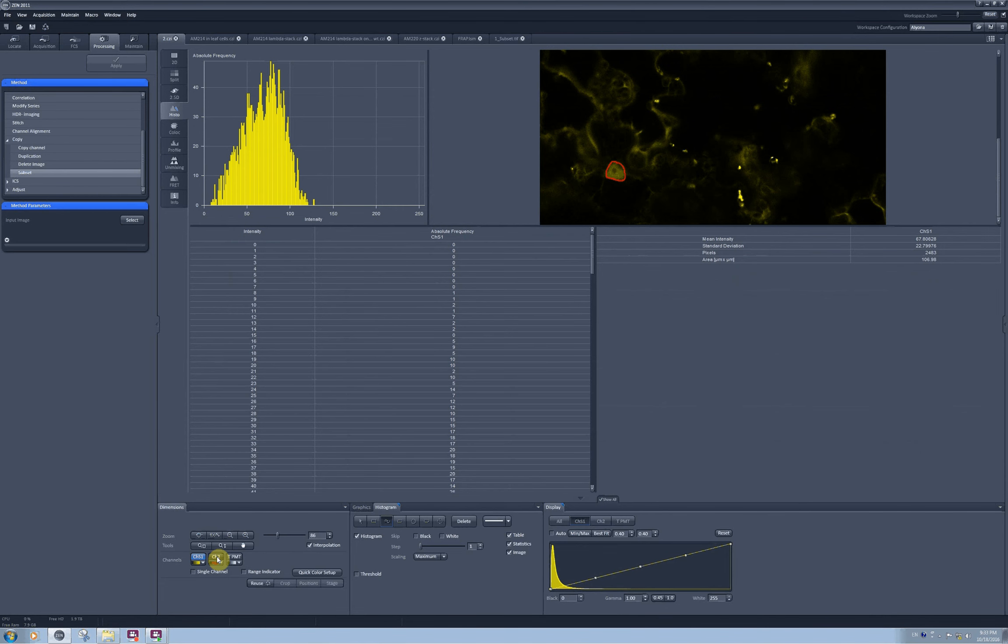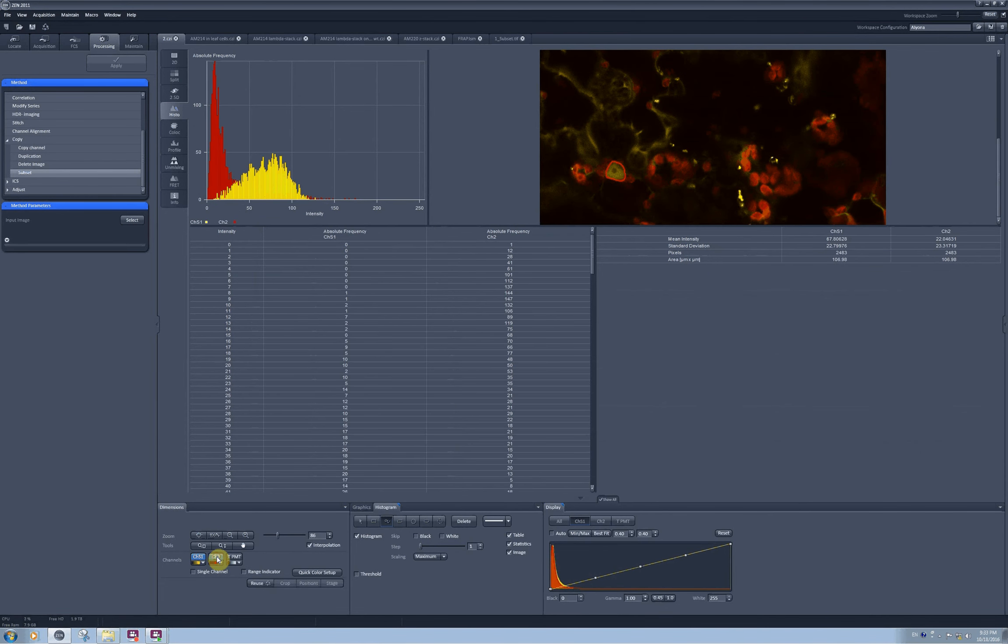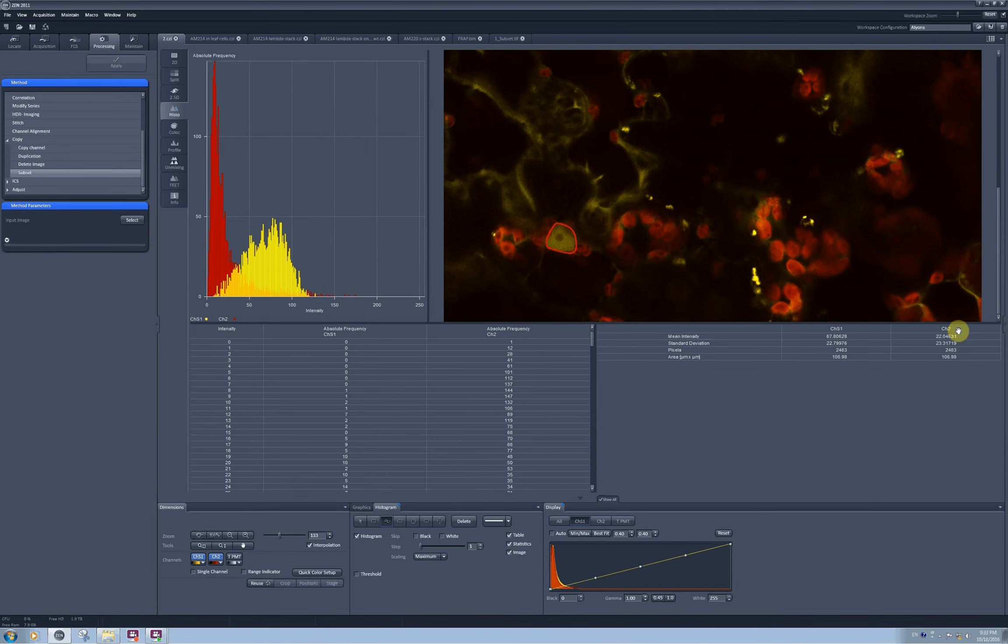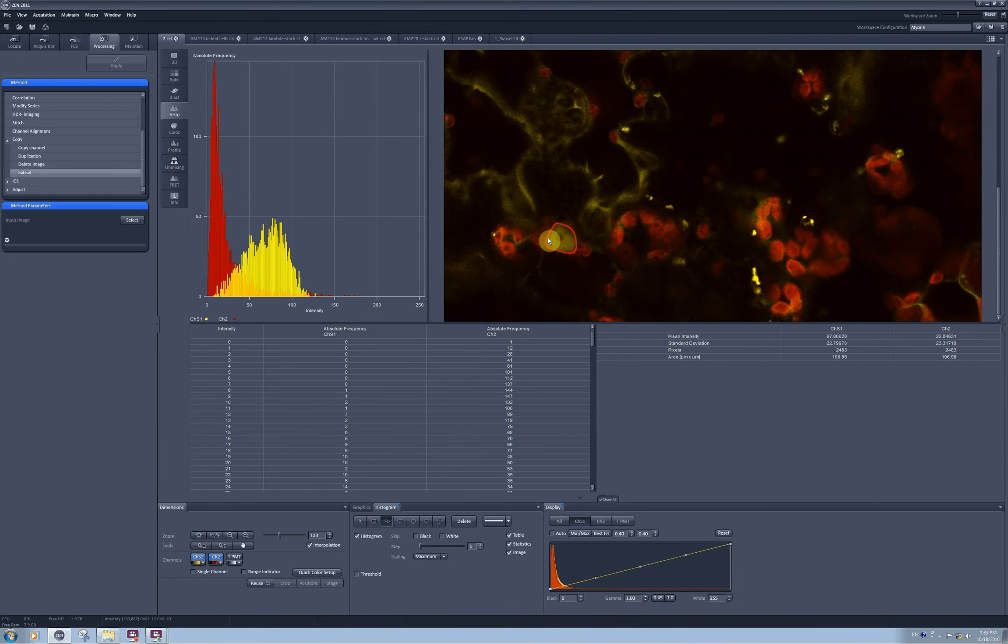If you activate right now the other channel, for example the red channel, the intensities for the red channel will be estimated for exactly the same selected region, which doesn't make any sense because I don't have any signal there.